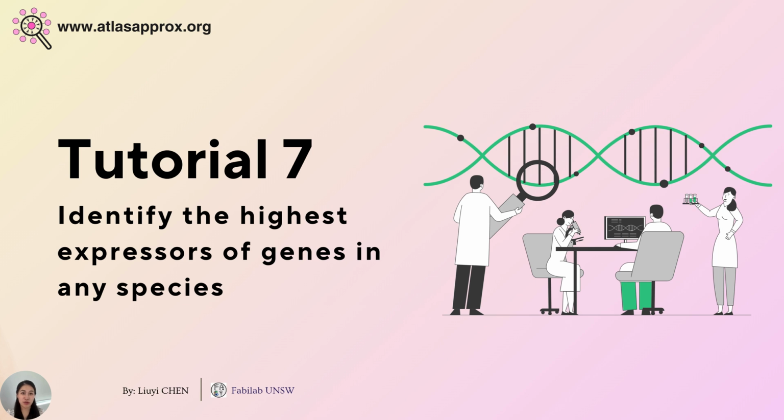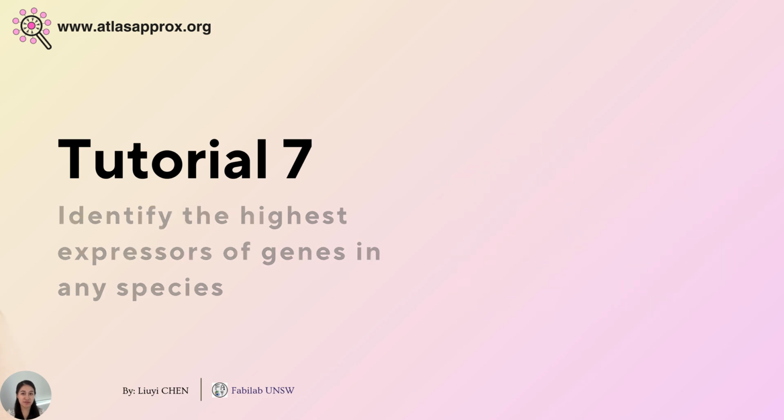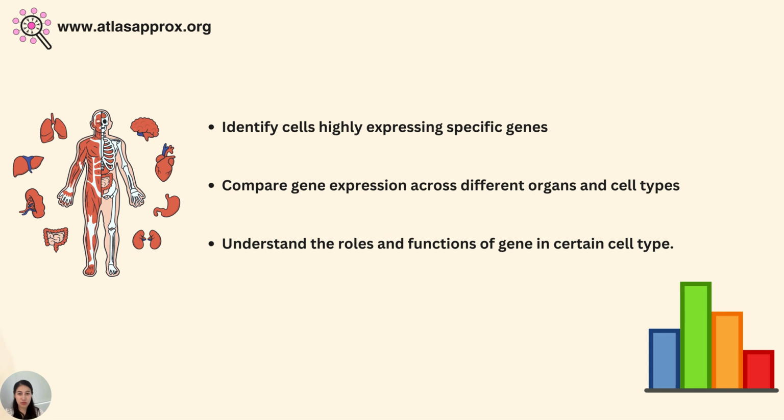Today I'm going to show you how to use our interface to identify the highest expressors of your genes of interest across different organs and cell types in any species. Maybe you feel a bit confused why we need to focus on the highest measurements.